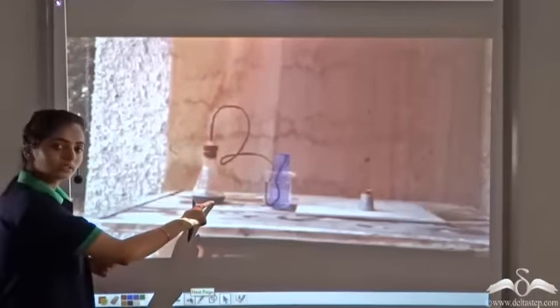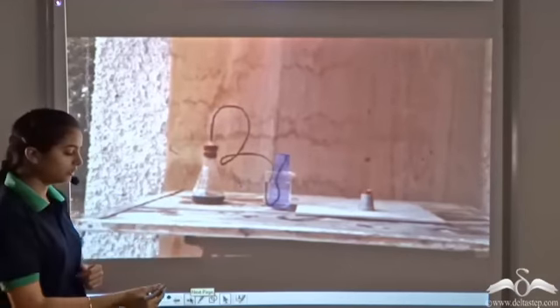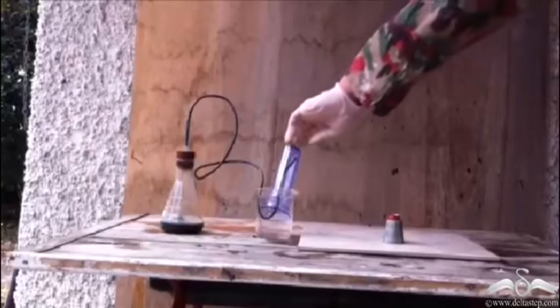This container, this conical flask, contains a mixture of hydrogen and sulfur. It forms another gas. As seen through the bubbles, the gaseous product is collected in this test tube. So you observe that the test tube rises as more and more gas is being formed.